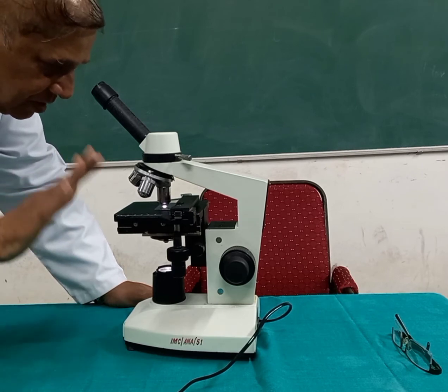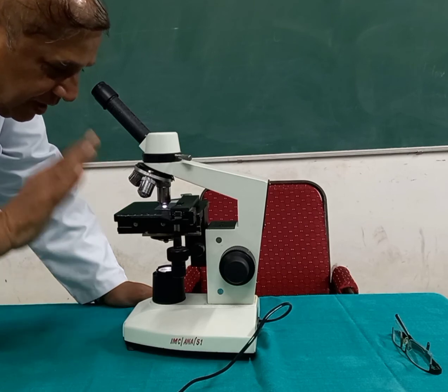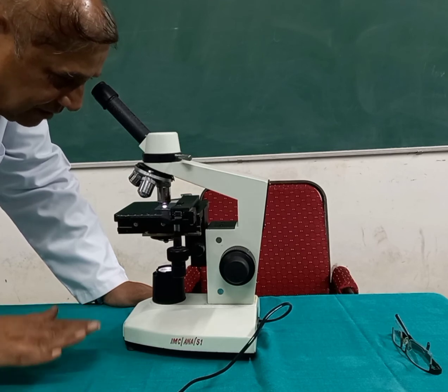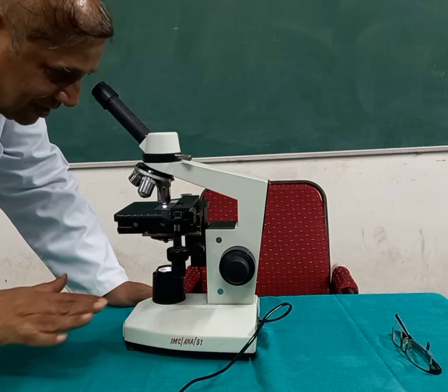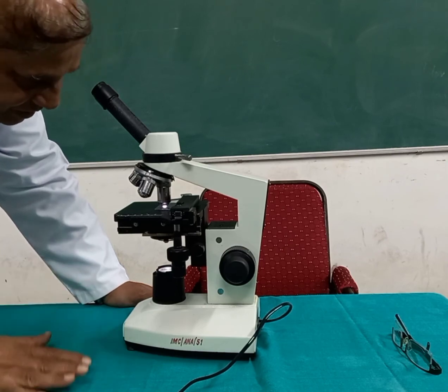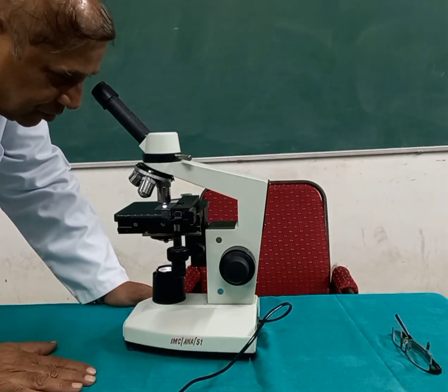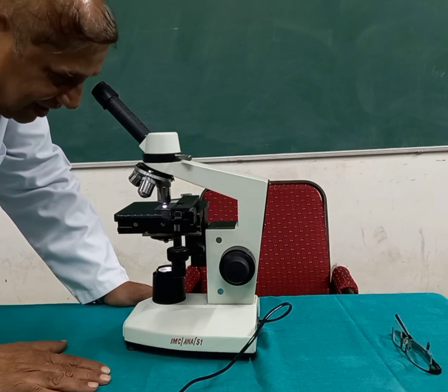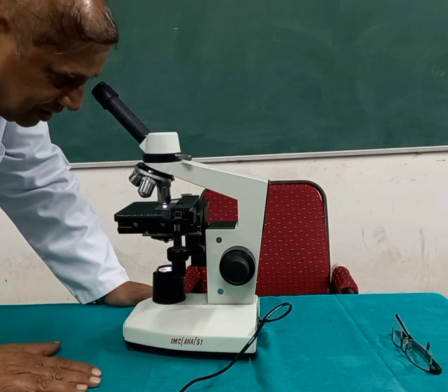Now this will not come to you in the very first step. You will have to practice again and again. So in the beginning we give 10 days or 1 week just for focusing the slide, to practice, and we ask the students to focus it with the help of the teachers, and within 1 week or 2 weeks at the most they become masters in focusing it, and then they don't break the slide. They can very easily focus the slide. So don't get upset, you will learn very easily within a few days how to focus a slide.